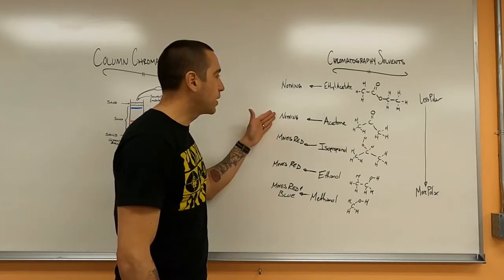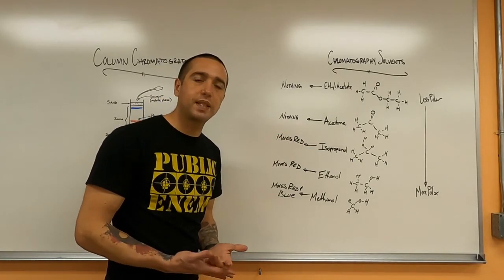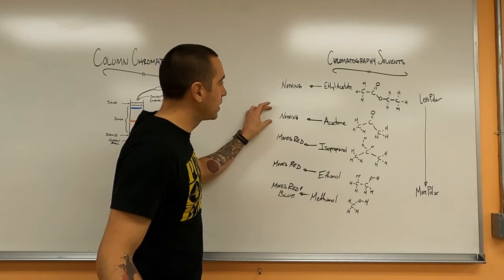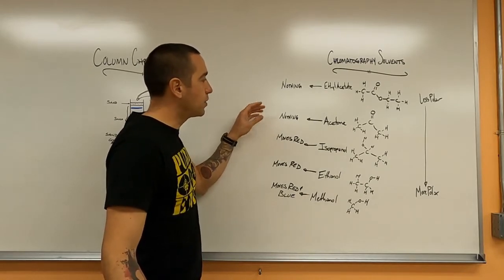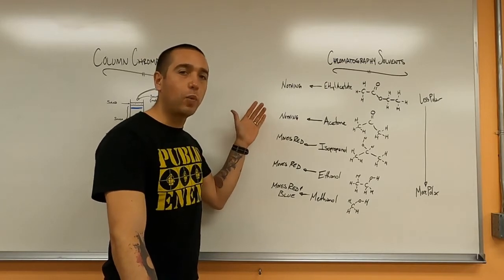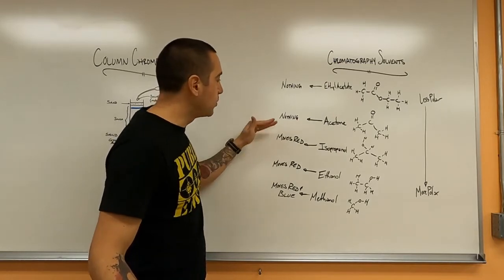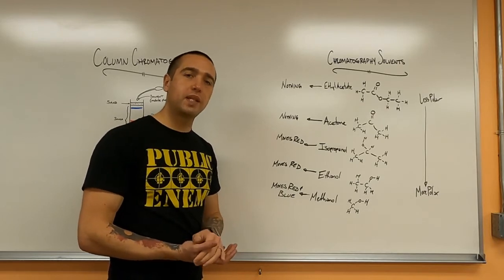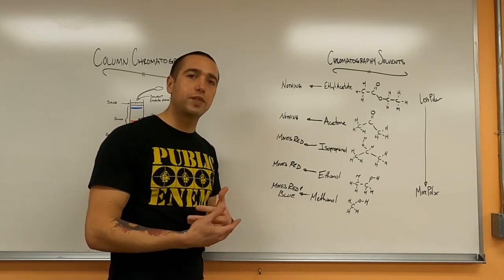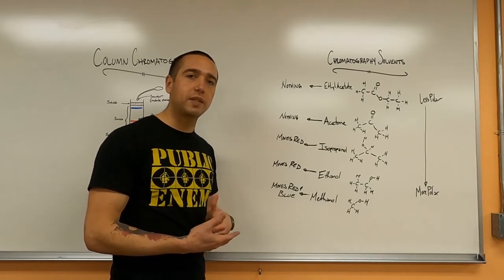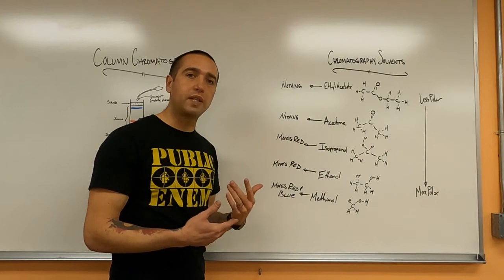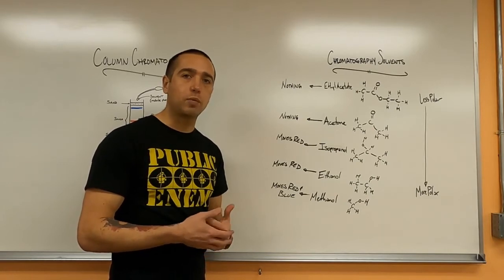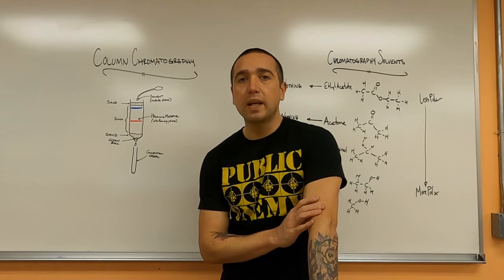We're going to prepare our column using acetone since it doesn't move either of the substances. You want to start with your least polar solvent that doesn't do anything, and that's the first solvent you'll get your column wet with. Then you move to more and more polar solvents after you apply your sample. The properties of silica are slightly different than paper, so we might see some different results. We might have to do two trials, but we'll keep our eyes on what's going on. Next I'll show you what this looks like and separate my mixture.